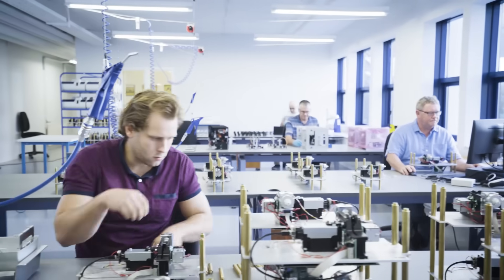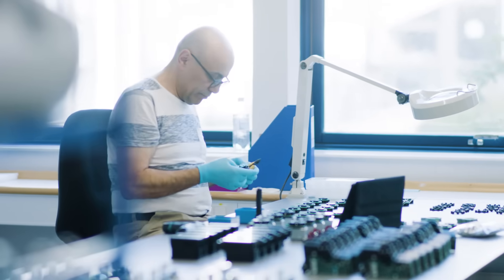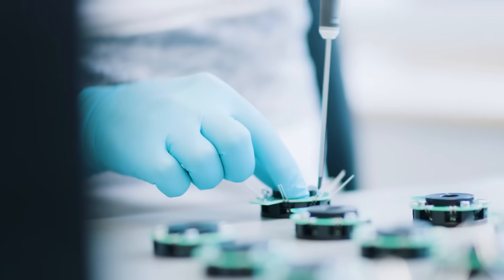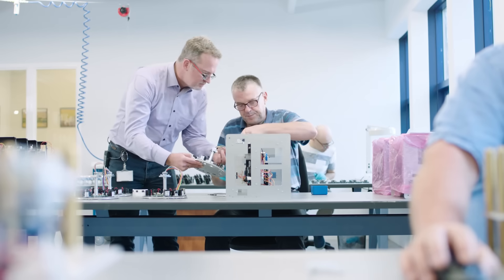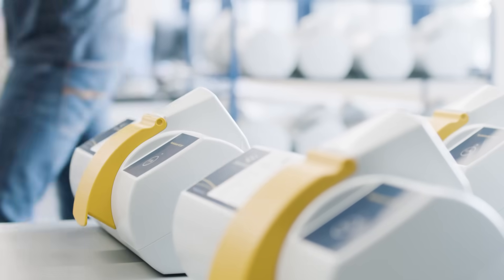These easy-to-use analytical instruments are working at laboratories across the globe, having been developed and built on-site in Denmark by our trusted team of engineers.